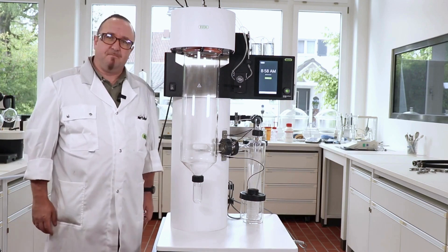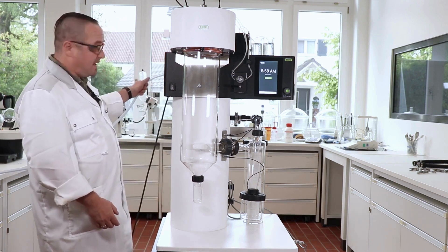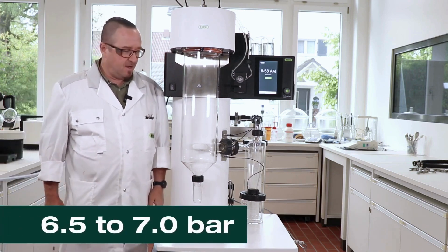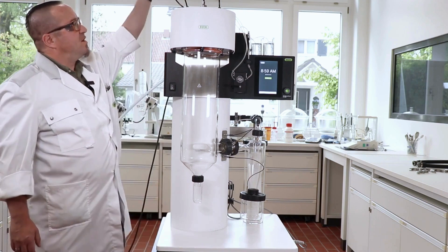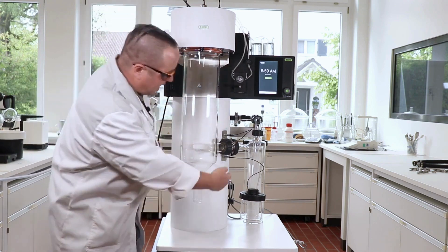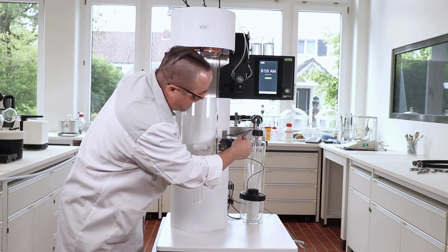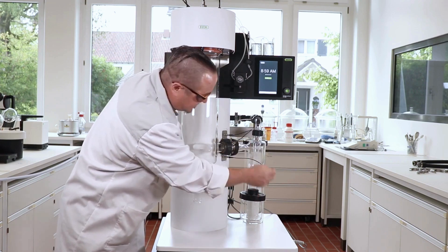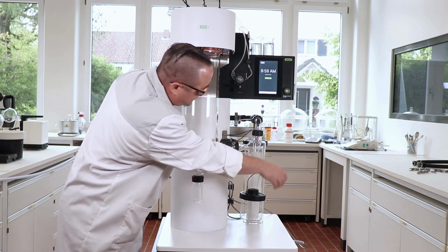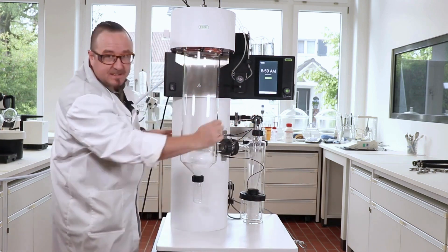Here we have an S300 mini spray dryer. It needs some power, but also some pressurized gas. We run the device with about 6.7 to 7 bars of pressure. Within the box you also have these nozzles, a drying chamber, a flange, a cyclone, a product-receiving vessel, a temperature outlet sensor, a product temperature sensor or a blind plug, and an angle tube. Then we have the outlet filter and the way back into the instrument.